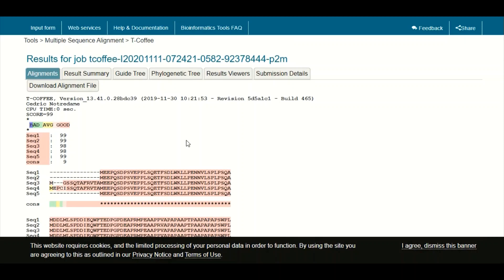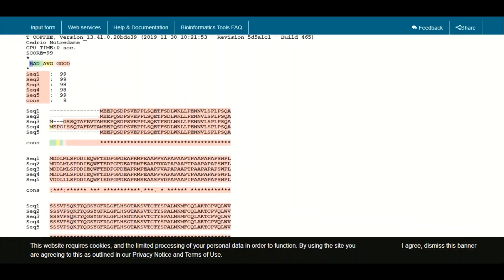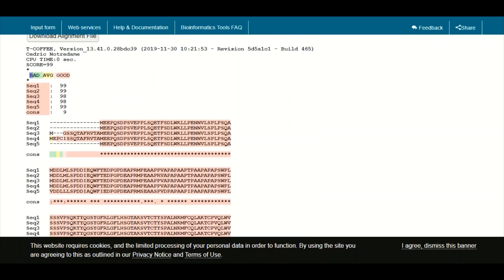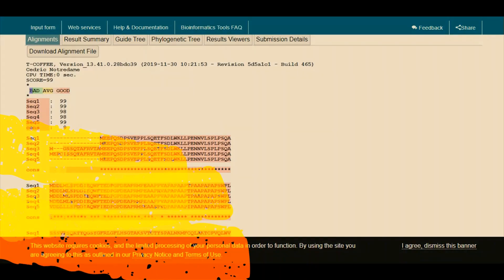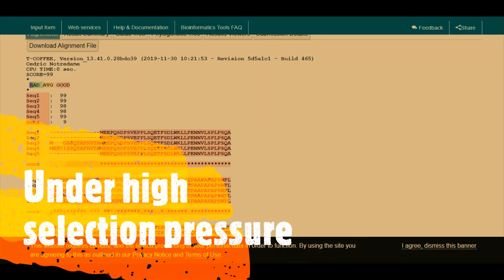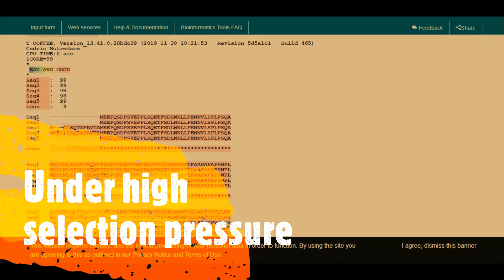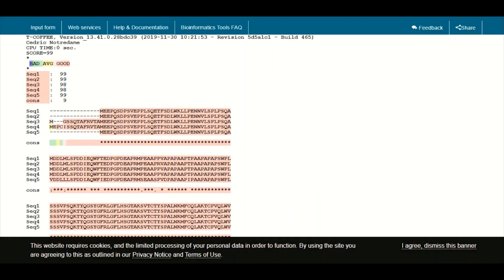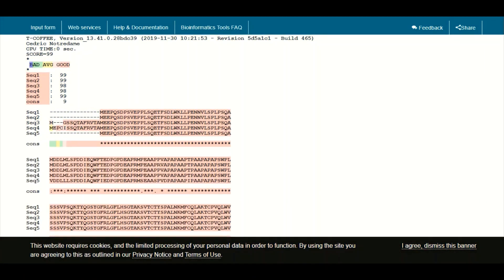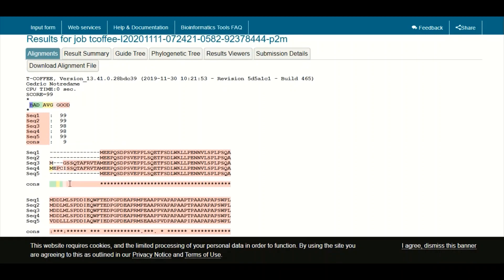The colors tell you about conservation. The red color indicates that these regions in all sequences are identical. From an evolutionary point of view, these regions are under high selection pressure and are very critical for the proper function and structure of the protein.